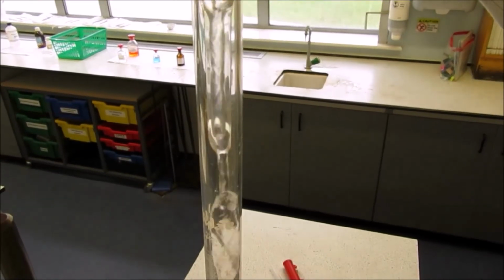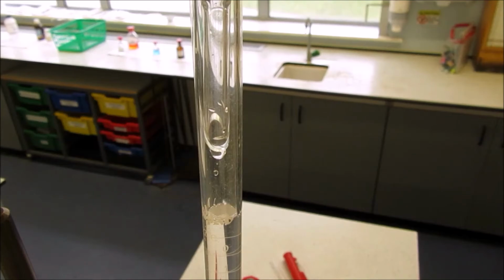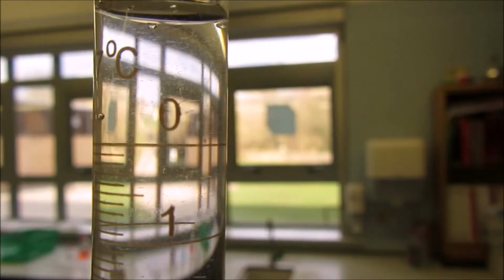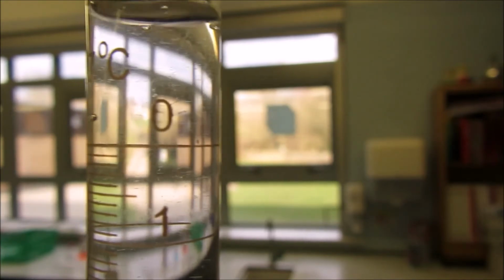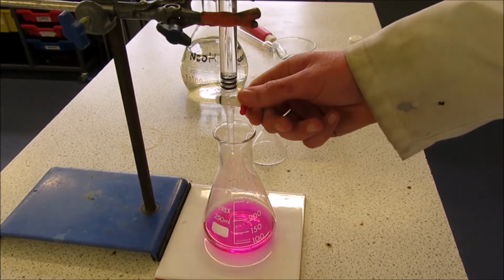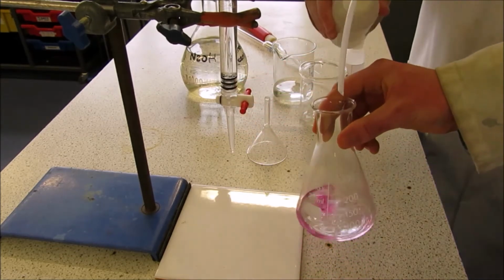Fill slightly above the top of the scale, but not too far, else the whole filling procedure will have to be repeated. Now, allow the acid to run through into a separate beaker until the meniscus is level to the 0 mark. The titration can now begin. Now write that down. First, perform a rough titer to obtain an estimate of where neutralization will occur.